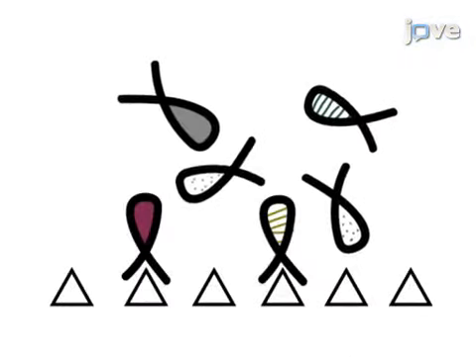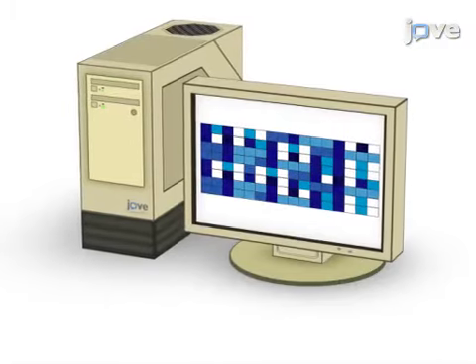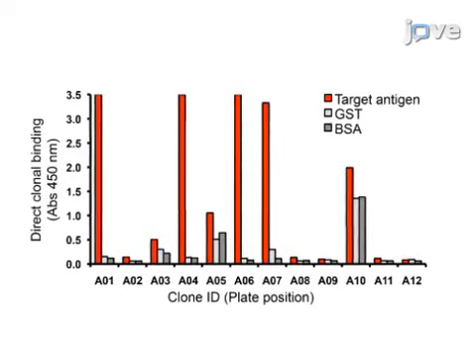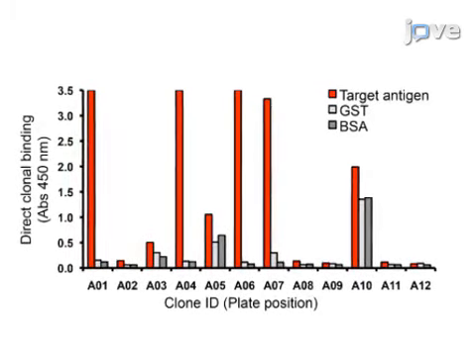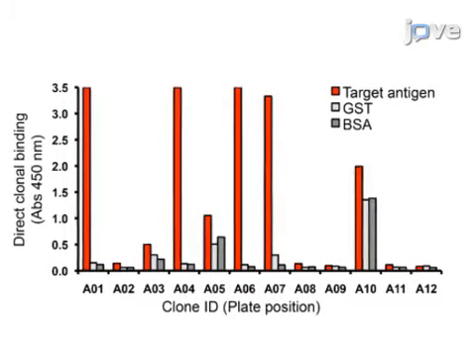The final step is to evaluate the specificity, affinity, and/or activity of the isolated Fab clones. Ultimately, specific high-affinity Fab fragments against large numbers of antigens are isolated in parallel, enabling the generation of antibodies useful in the analysis of entire classes of structurally or functionally related proteins.